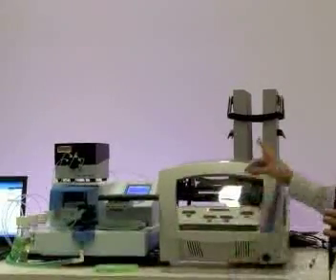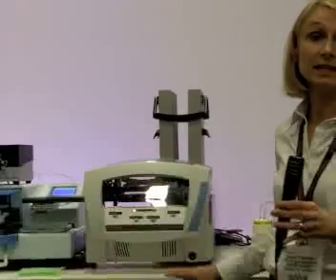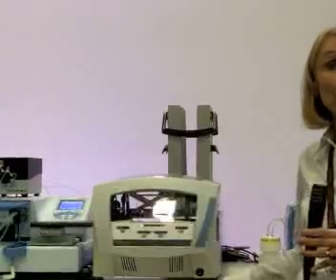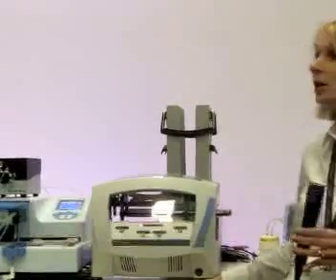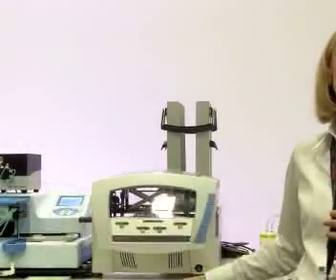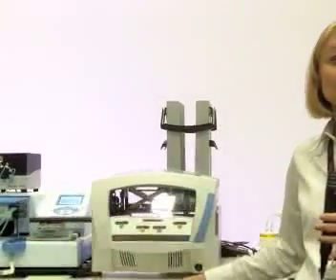So, some of the key benefits of the RapidStack is it can dispense from 50 up to 150 plates at a time. We also have a shortened version of the RapidStack that can fit into biosafety cabinets. We have a multitude of offerings on the web. If you would like to learn more, you can go to www.thermoscientific-rapidstack.com.